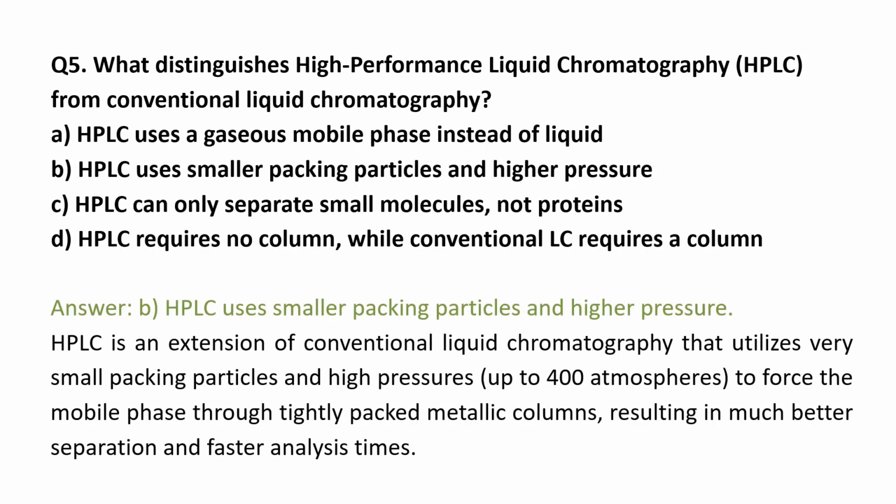HPLC is distinguished from conventional liquid chromatography by its use of smaller packing particles in the column, which increases the surface area for interactions, and higher pressure to push the mobile phase through the tightly packed column.